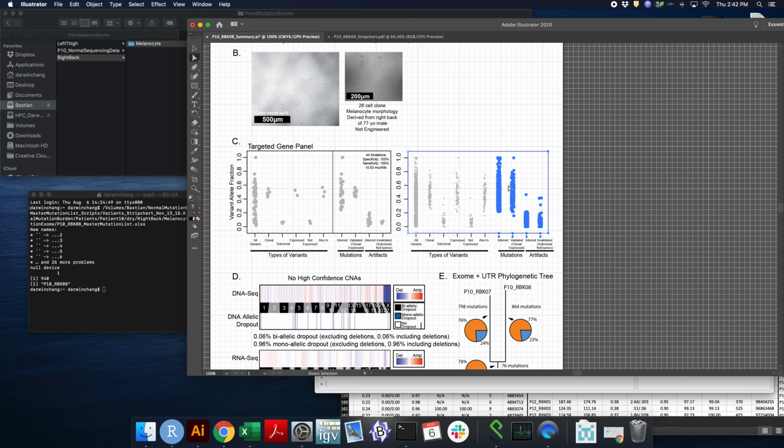You then want to take the last 4 columns and align them, kind of separated from the first 6. Grab this line, put it in the middle, kind of in between. Then take this title. If you're working with UCSF 500, label the title of the strip chart targeted gene panel. For my case with exome, we're going to label this exome plus UTR panel.